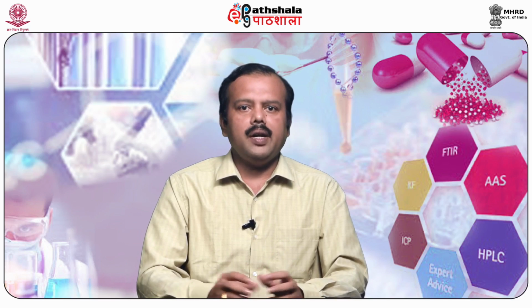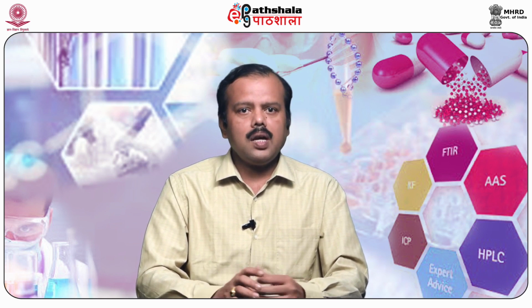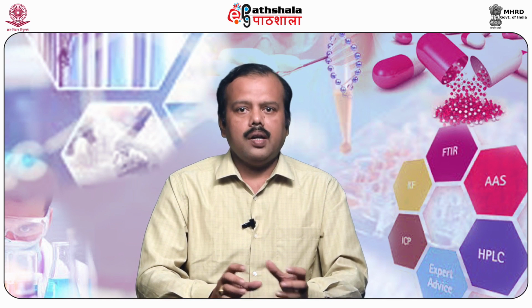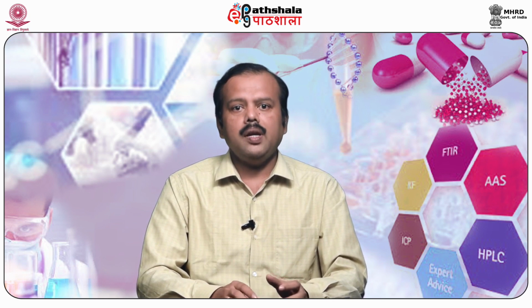Handling of a contaminated medium and disposal. It is very important to know how we can handle the contaminated medium and how to dispose of the medium after the experiment is over. The biological waste includes, but is not limited to, petri dishes, pipettes, culture flasks, syringes, needles and culture media, whatever we used in the experiments. All biological waste, including non-infectious and infectious waste generated during laboratory research, must be deactivated by autoclaving or by chemical treatment before disposal.